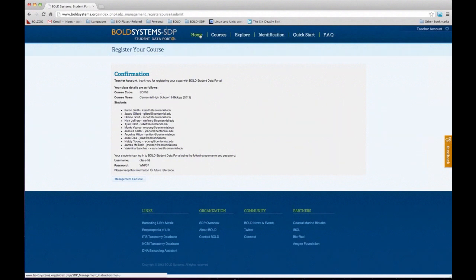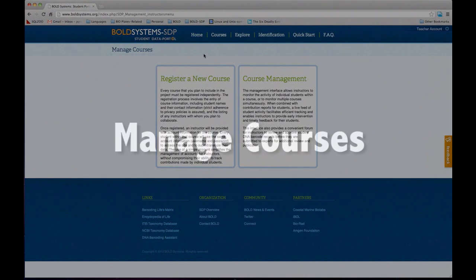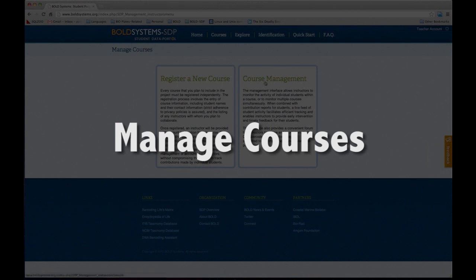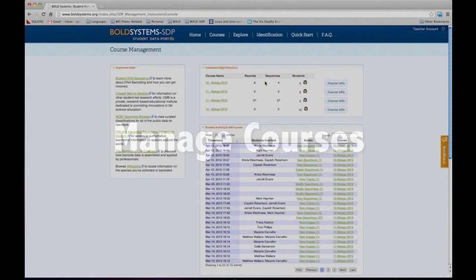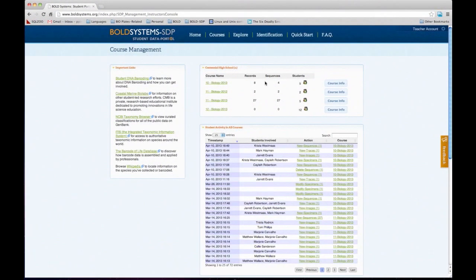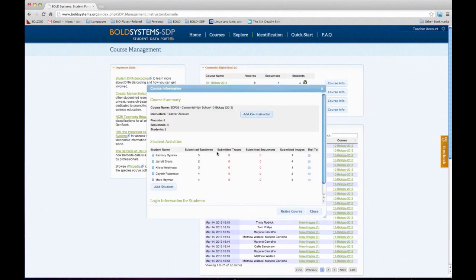Now that you have classes and students are providing data, you'll want to manage those courses. Here is the instructor console, which summarizes the information for all your courses. You can have multiple courses that you're managing — in this case I have four courses. I can click on Course Info and it gives me the number of students associated with that course, how many records the class has created, how many sequences, and I can add a co-instructor. You can add a co-instructor at any point — the only prerequisite is that person has to have a Bold instructor account as well.